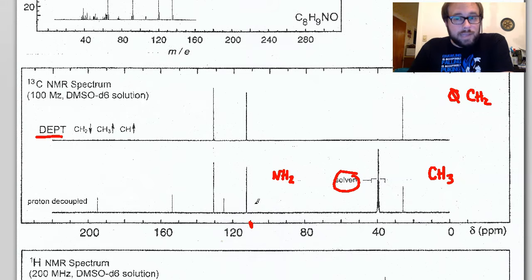And it would likely lead to a large upfield push in the aromatic region for the sets of protons that would be ortho to that electron donating group. So what we see here is the 200, the one that's up by 200 here, that is most definitely a carbonyl. That is way too high to be anything else. Okay? Now when you get close to 200, you are suggesting that this is most likely a ketone and not an amide.